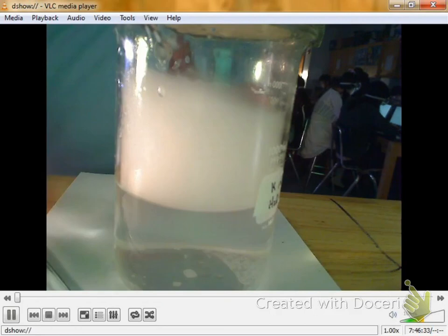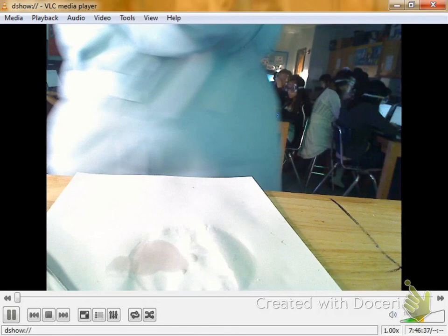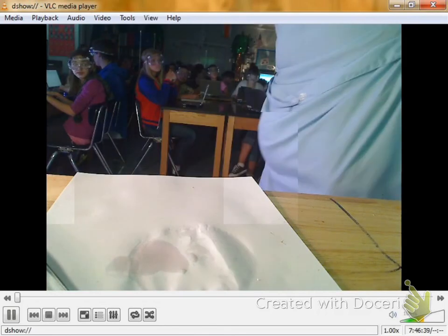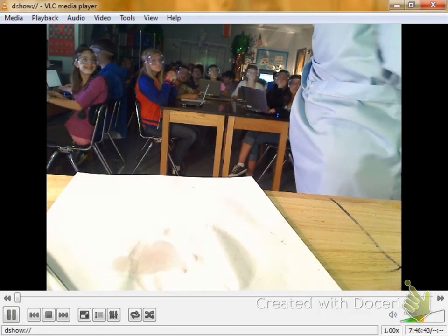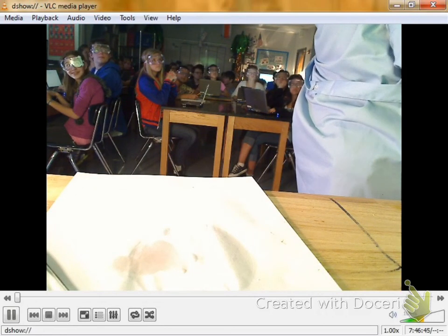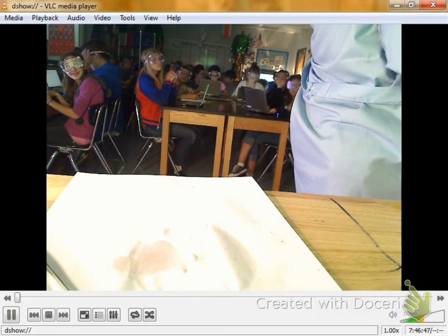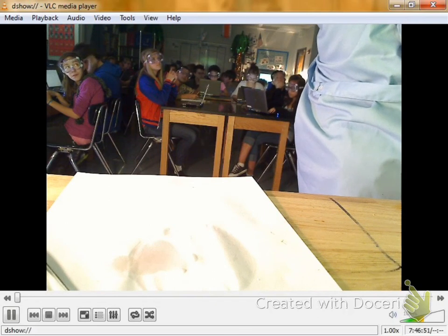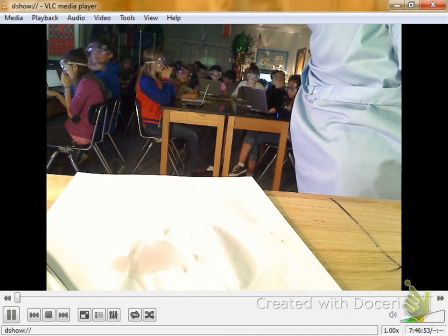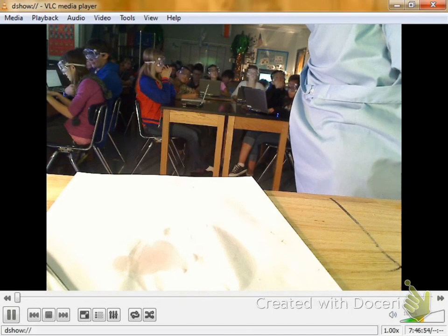That's also an example of fog. Alright, this is just a nice collection of hydrogen gas in this piece. And now I'll just let the vents take the hydrogen gas and pump it out into the environment. And it'll go into space because it's so light. Where's it going to go? Up.